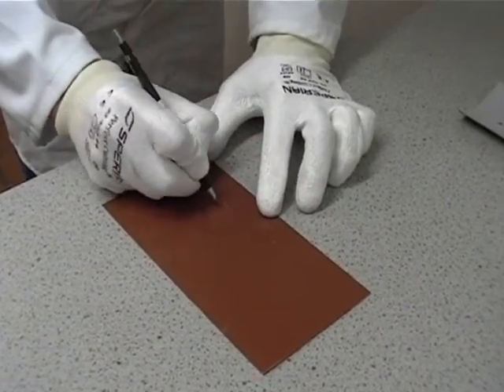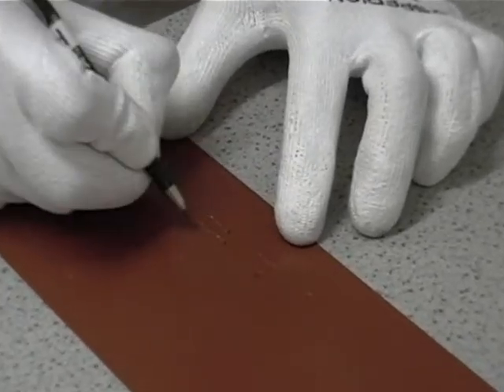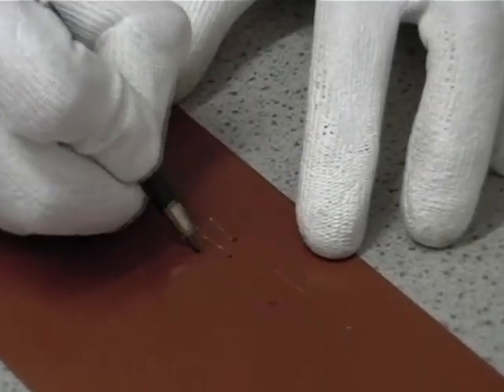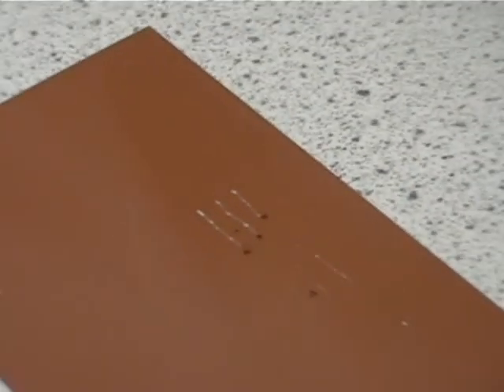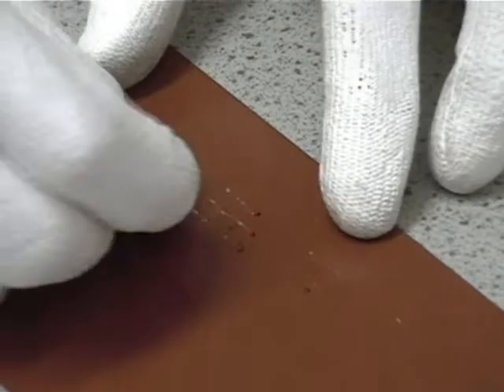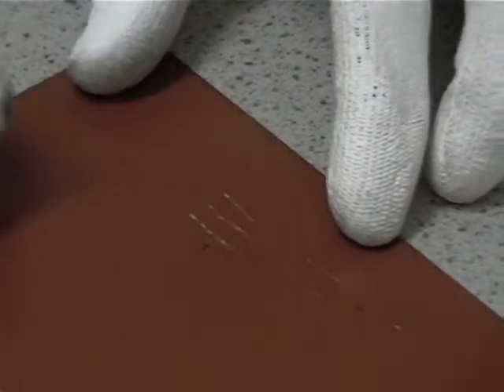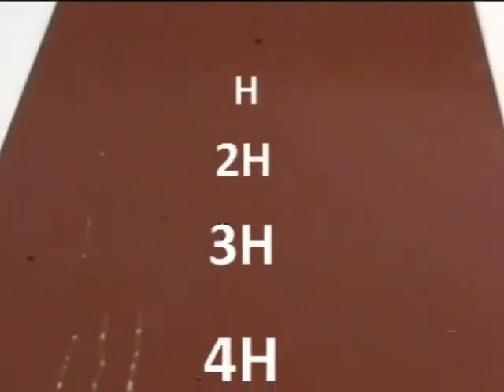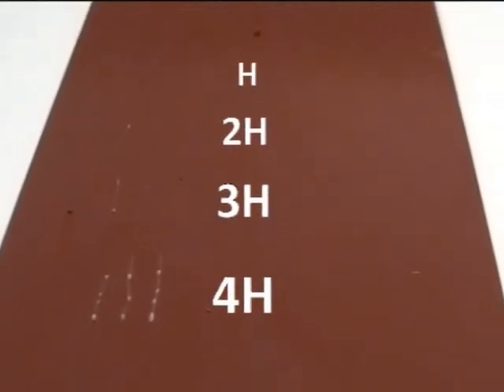A sample is deemed to have failed when a scratch of at least 3mm length is repeatably produced. In this case, although there were some marking from both the 2H and 3H pencils, it was only when using the 4H pencil that the sample failed. Hardness for this sample would be quoted as 3H, being the hardest pencil which did not cause a failure.